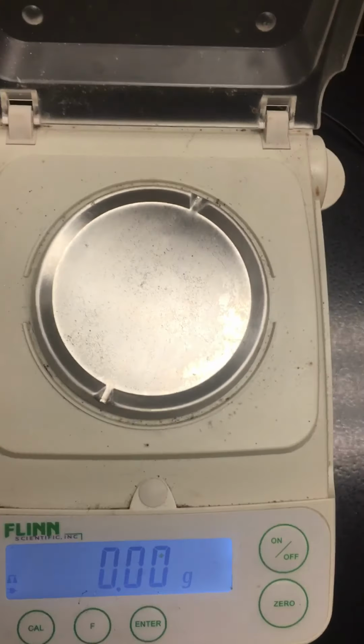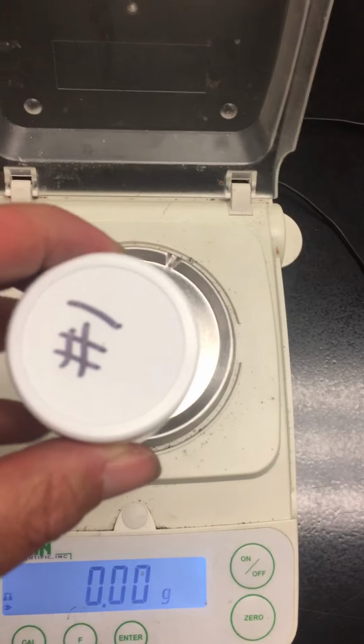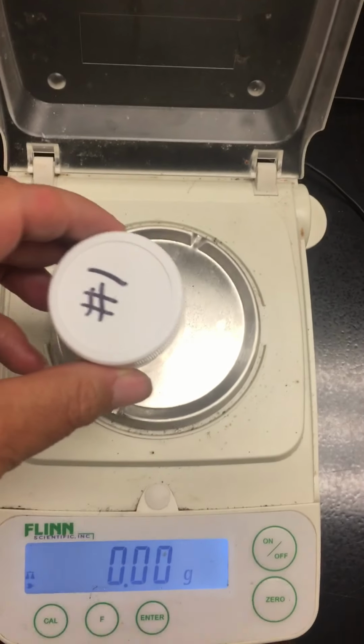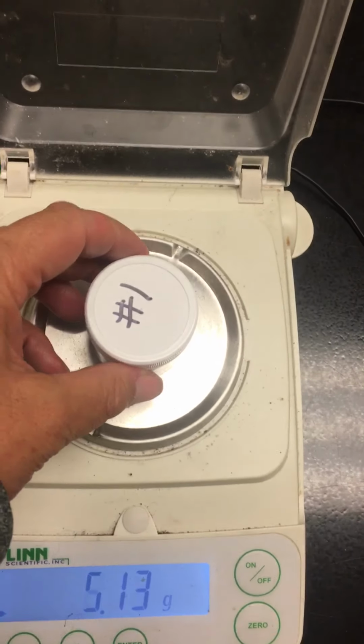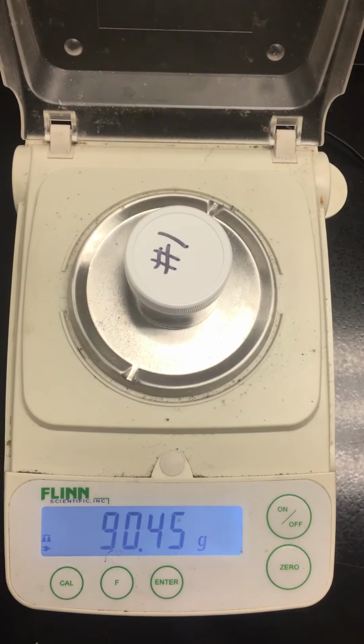So let's get going. We have sample number 1. And notice, it is in the container, so you are going to have to do measuring by differences. You will have to subtract the mass of the container and the lid. So write down the mass of number 1 in your first data table.